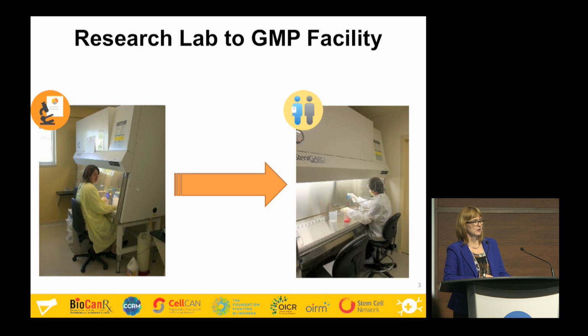When you go from the research lab with your product to a GMP facility in order to produce for a clinical trial where your product is actually used in humans, you can see firsthand some differences, which are in the cleanliness, the environment, how the installation is built. And I show two examples. On the left hand is a picture of our research lab, and on the right hand is a picture of our clean room. So you see there is more gowning, there is less clutter, and also the flow hood remains the same.